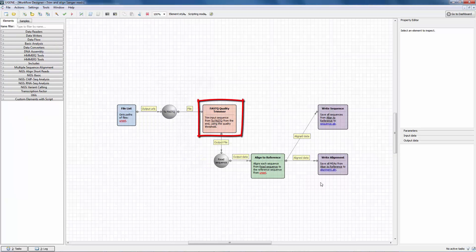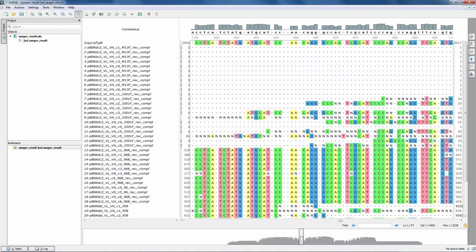This particular workflow trims each Sanger read, cutting off ends with bad quality, and then aligns them to a reference sequence.